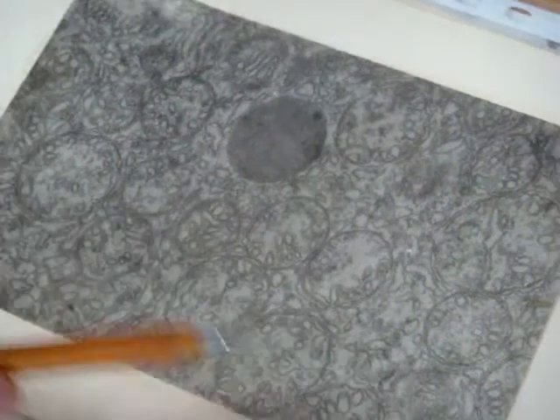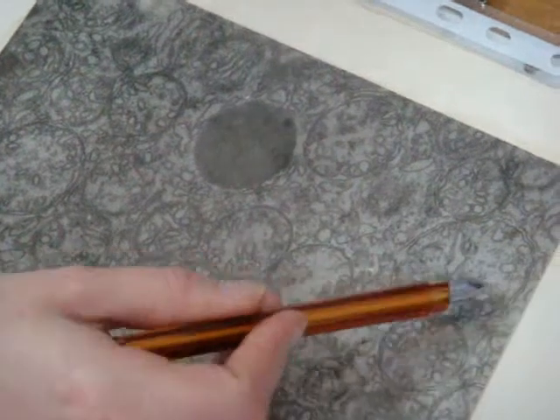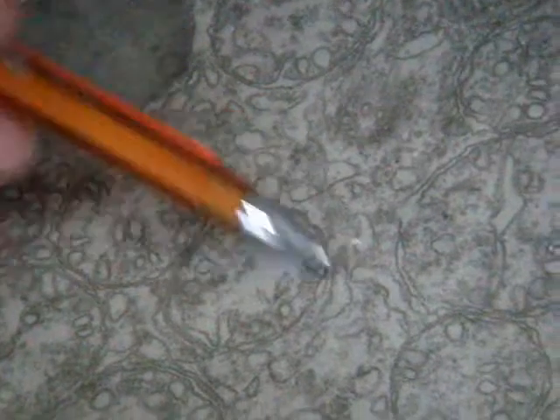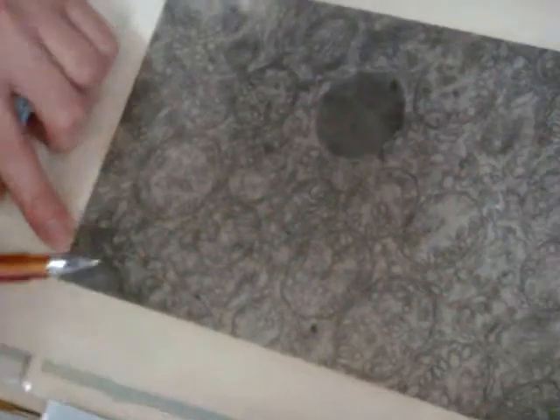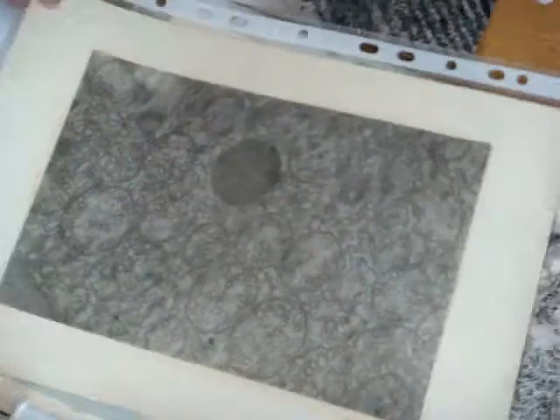This is part of one cell, and we can see what organelles? Mitochondria, because we can see the double membrane, and look at the shape of the cristae. This is the tubular vesicle type of cristae. Such mitochondria exist only in cells that produce lipid, and we can find such mitochondria in the cortex of the adrenal gland. Steroid hormones. And between the mitochondria, a lot of smooth endoplasmic reticulum and lipid droplets. They use it for the synthesis. Cells use. What is it? Maybe nucleus. Lipid, yes. Lipid droplet.